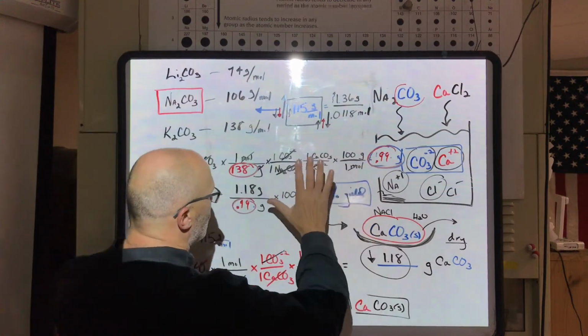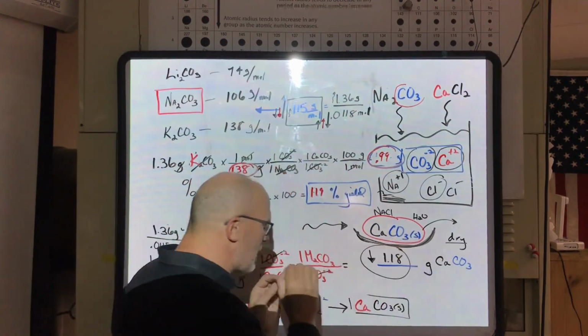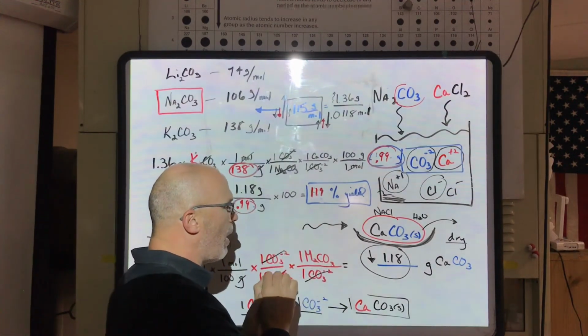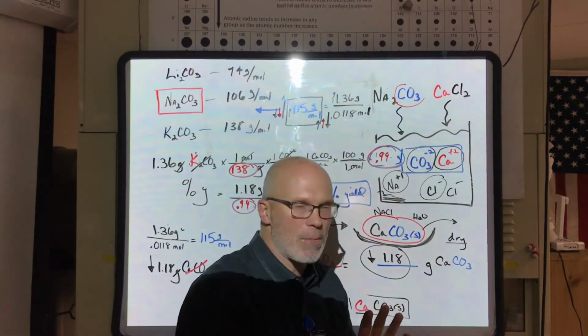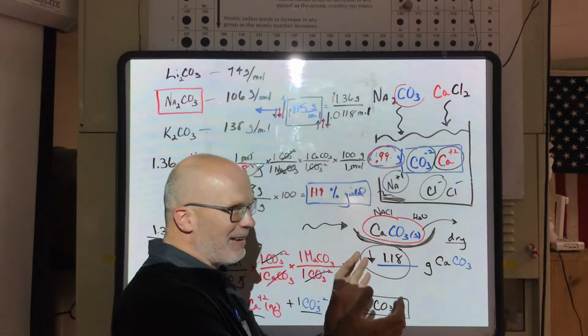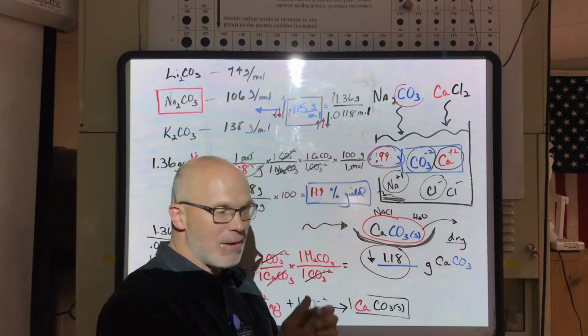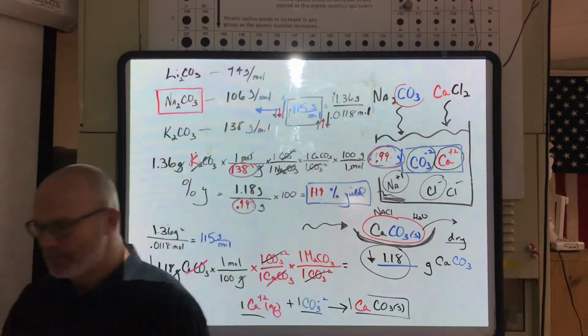But I love the percent yield with the idea that it's almost impossible to get all of our mass of our carbonate, assuming that we did dry it out. That's a major player here. And for the most part, they look pretty dried, even though I didn't verify. So I hope that helped.